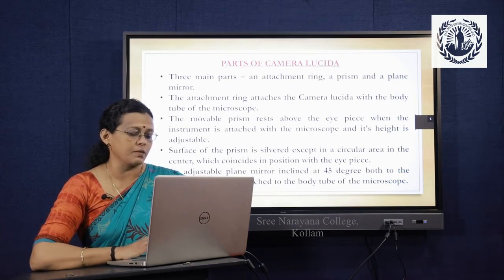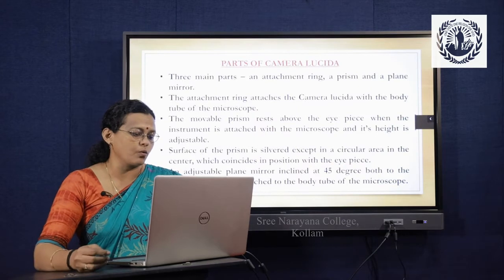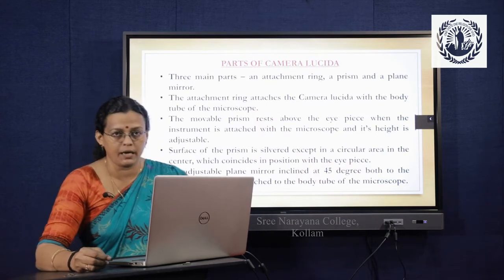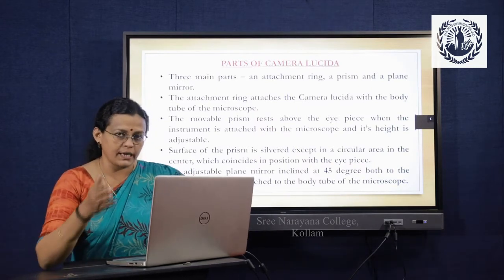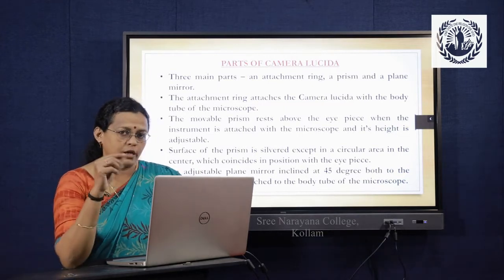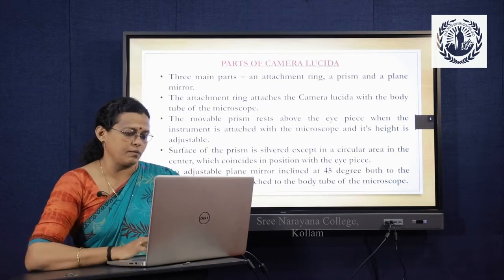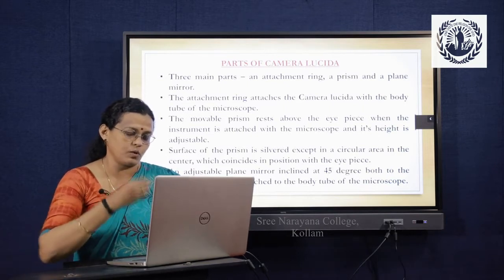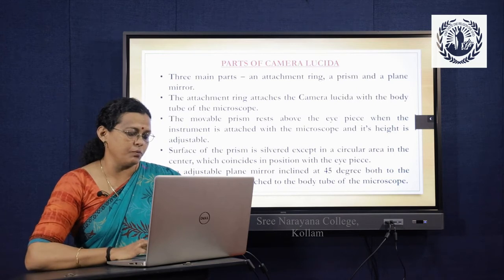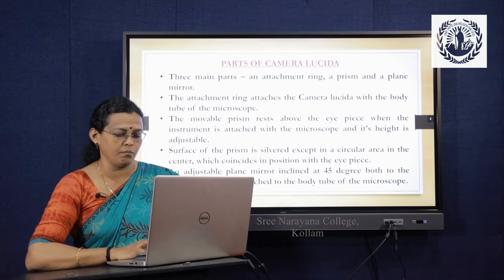The surface of the prism is silvered except in a circular area in the center which coincides in position with the eyepiece. So you know that light passes through a straight line. So there is silvering only on the surface or in the boundary of the prism, so that the light can pass through a straight line. An adjustable mirror inclined at 45 degrees both to the desk and prism is attached to the body tube of the microscope.